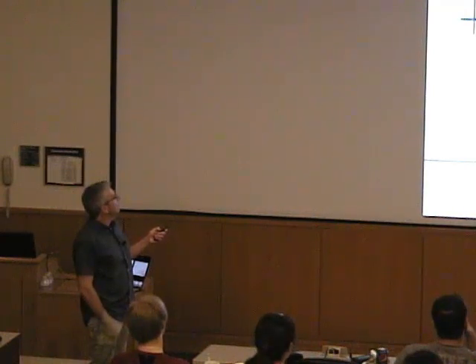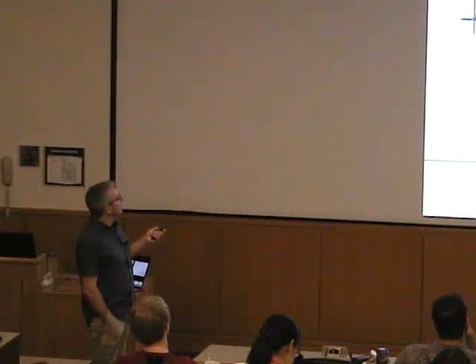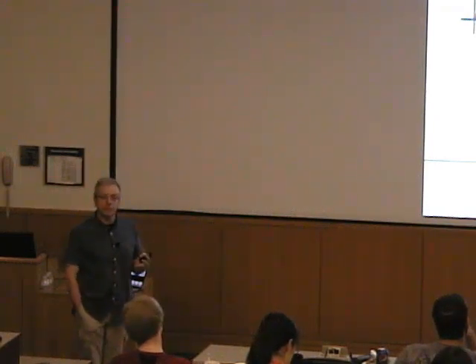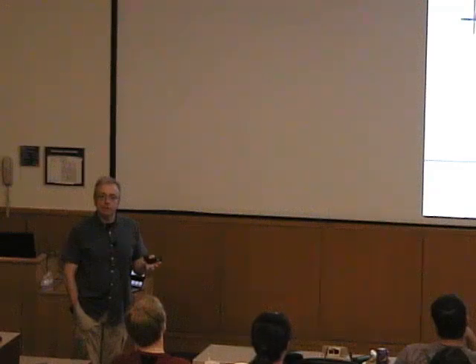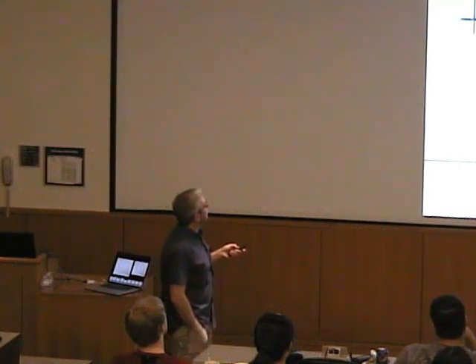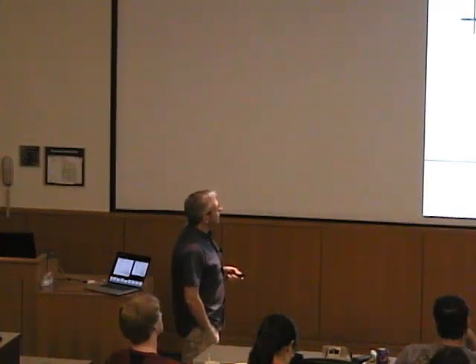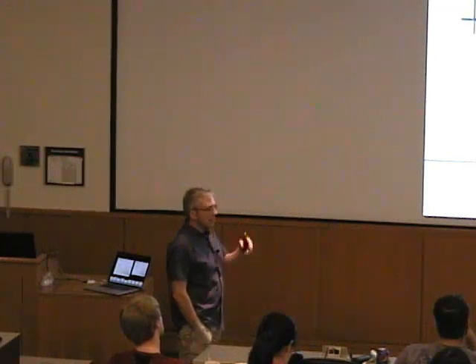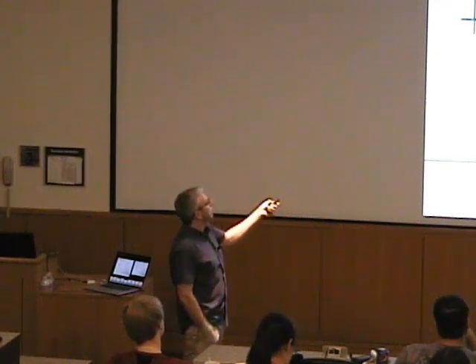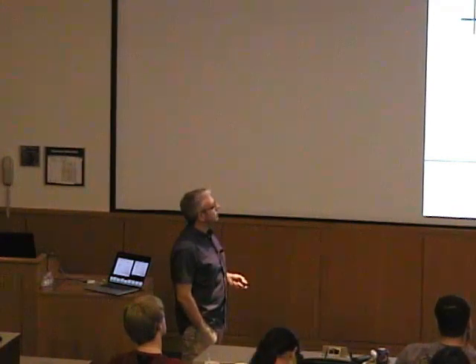Imagine real space. You have a structure of limited complexity, let's say 3 atoms. Okay? And these 3 atoms have positional vectors in real space. That's what you see in an electron density map. You do not see that in a Patterson map. In a Patterson map, you get vectors between these atoms only. And they have no relative position. They all come from the origin. So what you get is a Patterson map, UV space. No, it's an angstrom space. It's a real space, but it's not a space that gives you real atom positions, where you basically place all these vectors going in both directions.